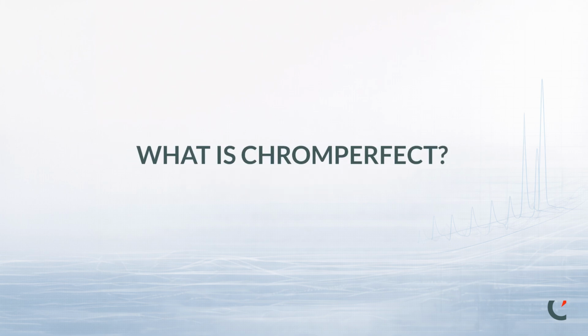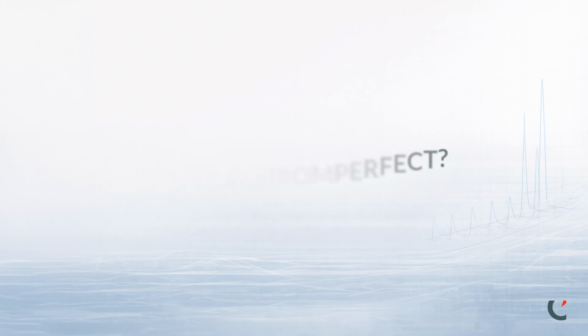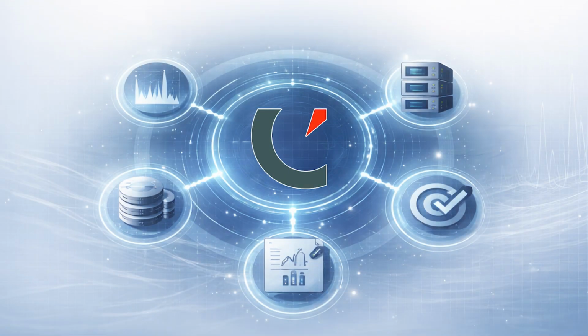Let's begin by answering the most fundamental question. What is Chromperfect? Chromperfect is a chromatography data system. It manages instrument communication, data acquisition, data processing, calibration, reporting, and structured data storage within a controlled software environment.